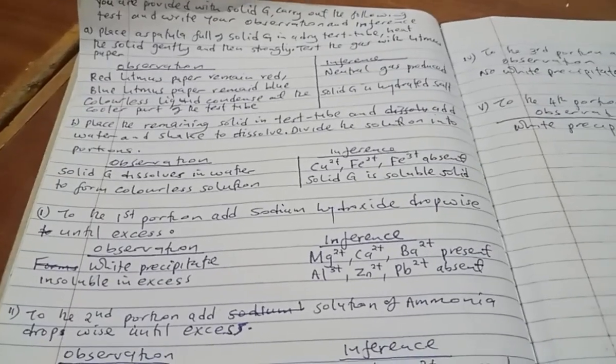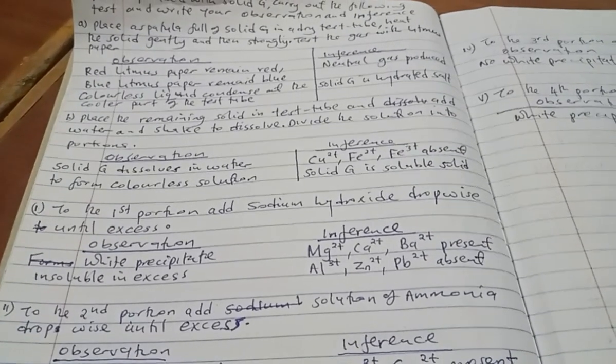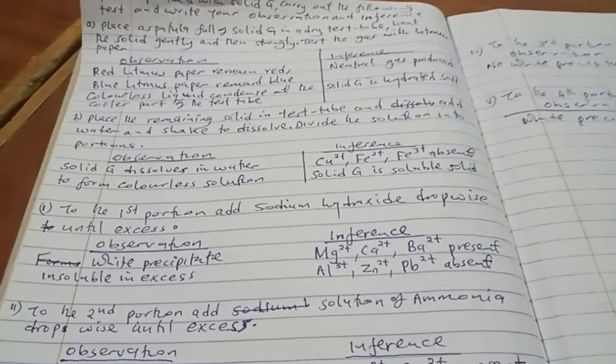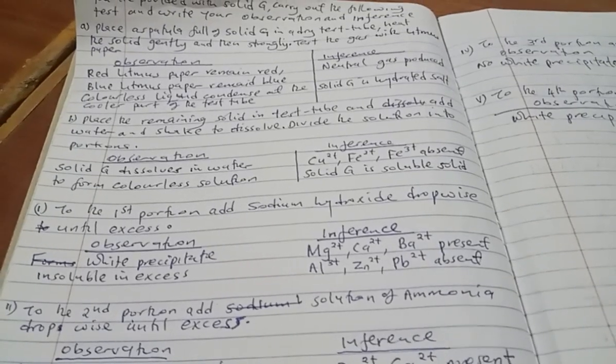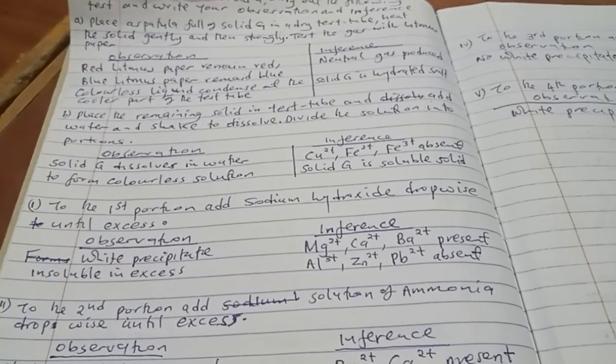That is, it dissolves. So most students just normally write under observation, they just write form colorless solution. That statement is incomplete. You need to write solid G dissolves in water to form colorless solution.